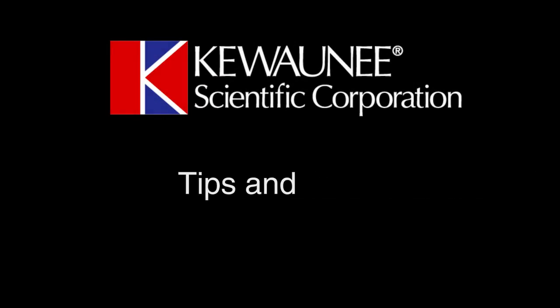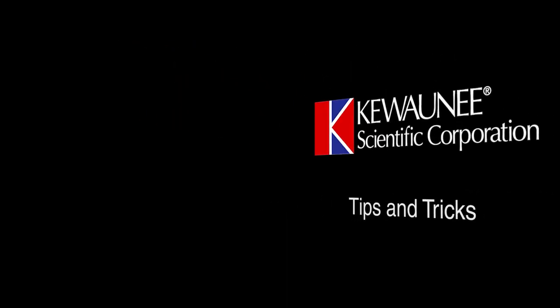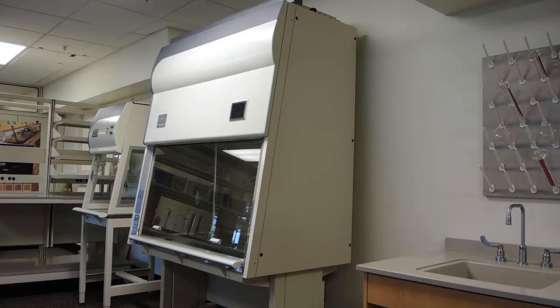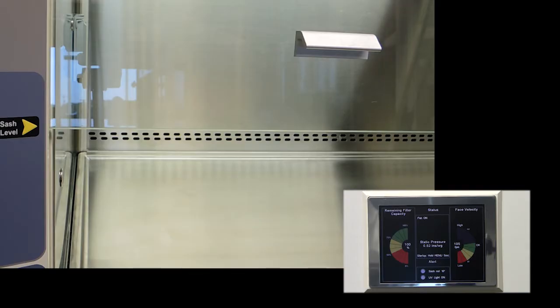This is Kewaunee Scientific Tips and Tricks. This video covers adjusting micro switches on our Interceptor biological safety cabinets that were manufactured between March 2013 and October 2016. These switches monitor the sash position and trigger an alarm when the sash is not in the correct position.